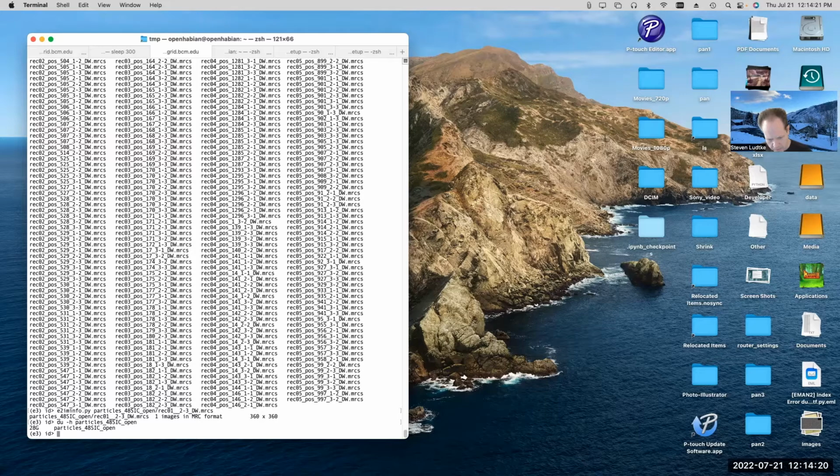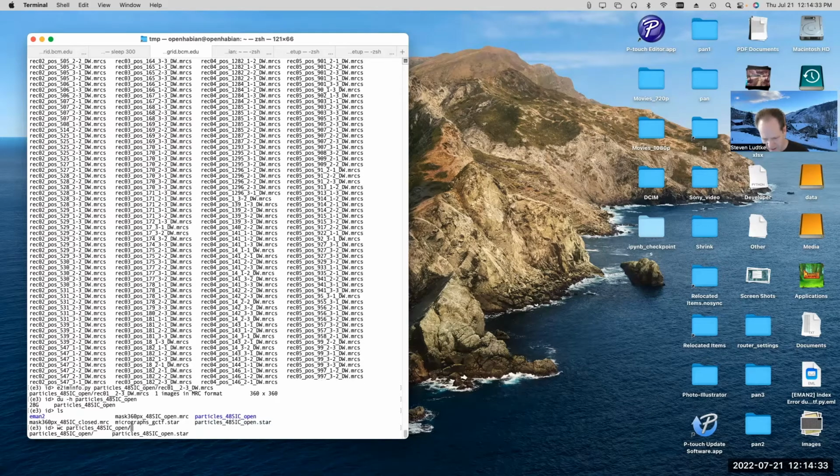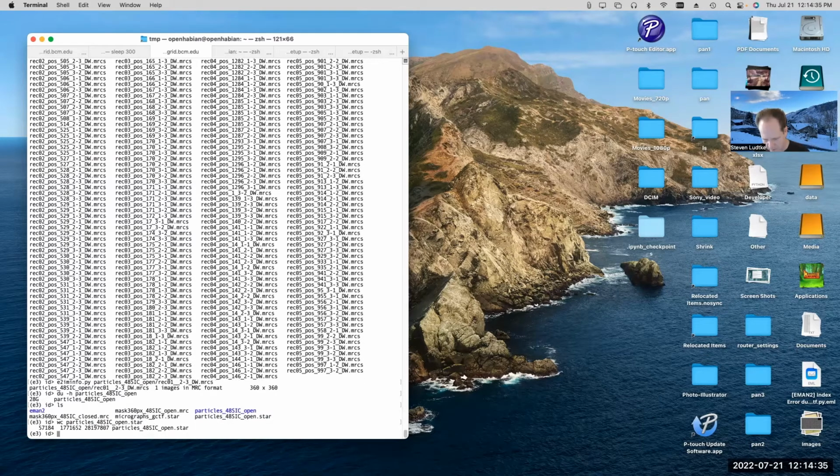So you can see the data is 28 gigabytes total. And we also have the star file associated with the data. If we do a wc on the star file, we won't get an exact count of particles because there's other stuff in the star file too, but we get a rough count of particles that way as well.